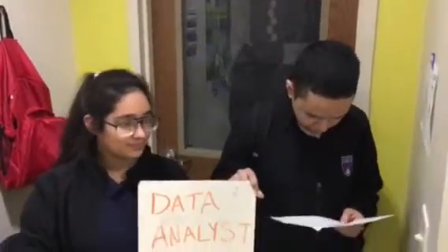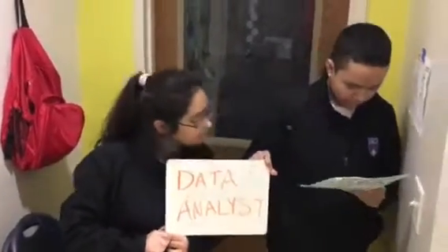Our hypothesis is that nutrient labels are not accurate and that nutrient labels are higher than the actual calculations. Also, our reference is that 1 out of 5 foods tested are higher than the actual calorie label. The specific heat of water and its change in temperature will be used to determine the calorie amount of a food sample.